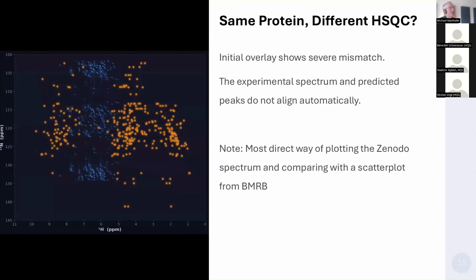Now, if you start this and take maybe a naive approach to plotting all these data, I show here something that is pretty bad, to show you how you can then improve step by step. What was done here was that you take the BMRB shifts and look at every case where you have a 1H and a 15N and look at their frequencies.